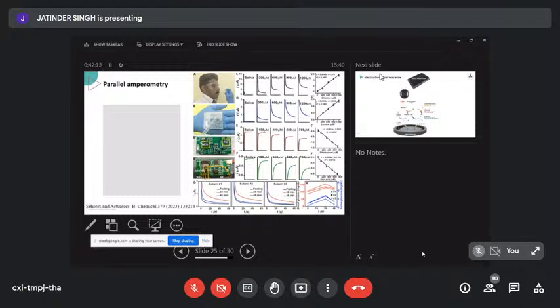All these sensors, here you can see the calibration data. And here you can see the biomarker profiles of this subject. The nice thing about the microfluidics system is sensors have the problem that they only sense one thing at a time, but the microfluidic system allows you to put four different sensors in parallel, which means that you can measure four biomarkers at the same time. And here you can see that between some different subjects.